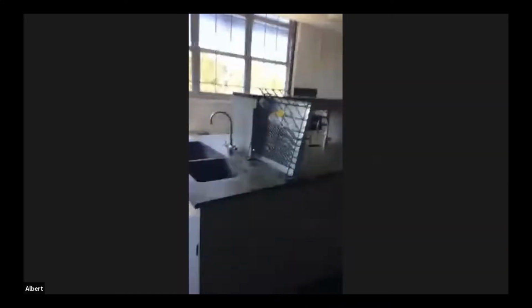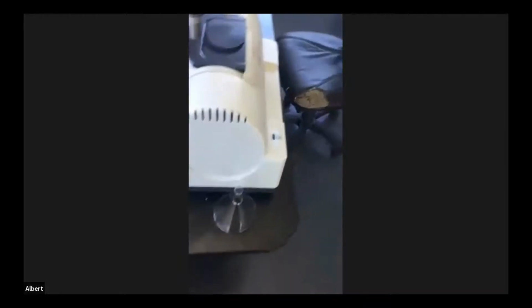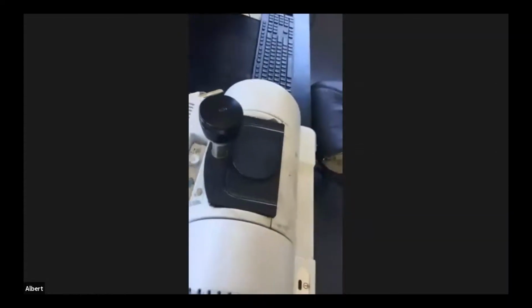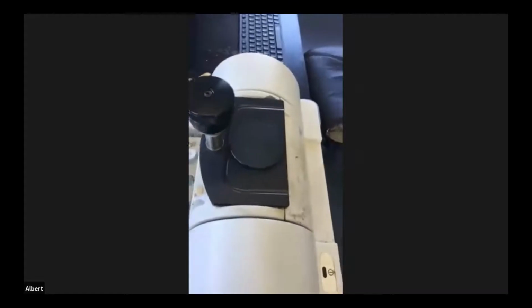So the FTIR, and these infrared instruments used to be huge, but modern technology saves the day once again. So this is an example of the FTIR. This is the instrument that we'll be using. And we're just going to basically put our sample here on this plate, and we're going to put a diamond tip over it. And the infrared radiation will be coming through that tip and onto the sample, and it'll be absorbed by the sample.